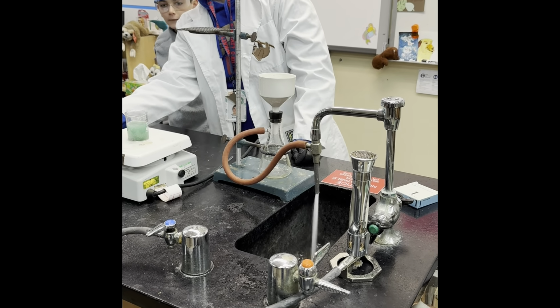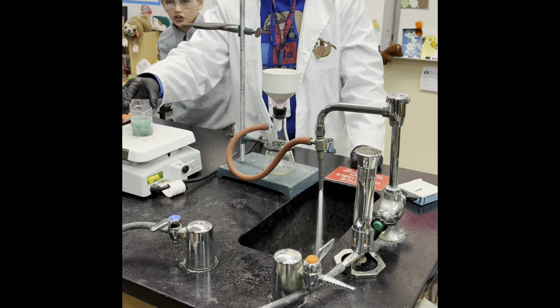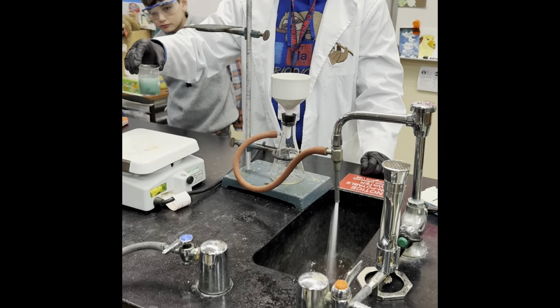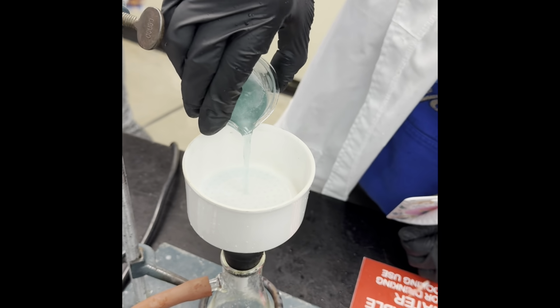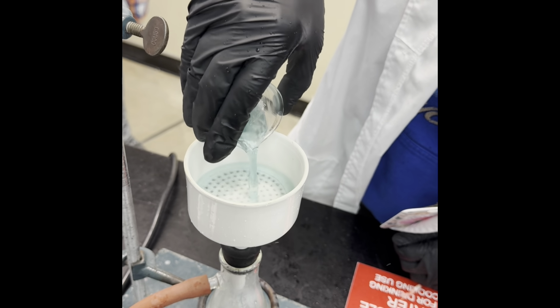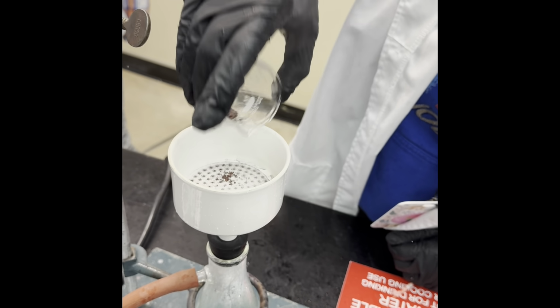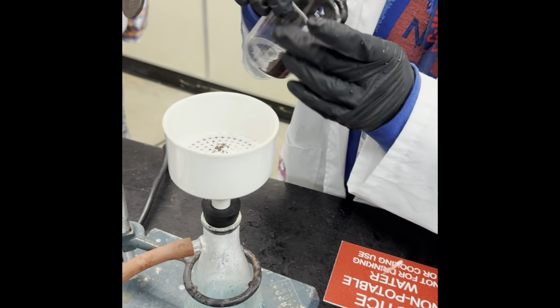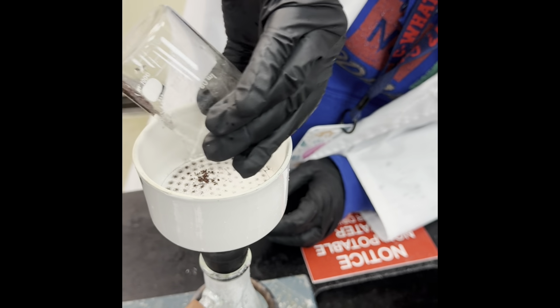and so it's pulling air out of there. And so I see a change in the temperature, or the iron. Be really careful because it is hot. We're gonna filter that solid off into our funnel. And it's okay if I leave some because I'm actually going to heat the beaker again.